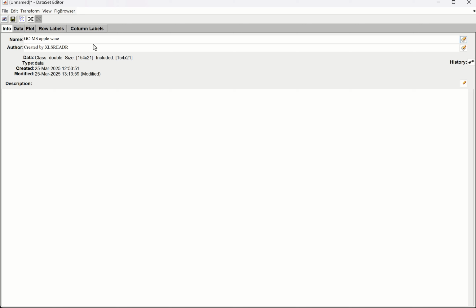Let me just take a look here. Okay, this is ethyl acetate, plotted versus time. I'm just going to plot on a linear index. We can see 3 different fermentations. Acetone, there we are. Okay, so that's the result we got at the time. And what you can see here is that there's a certain threshold below which all values are set to 0 because it's below limit of detection. In ChemStation, you have to be able to see the peak to integrate it.